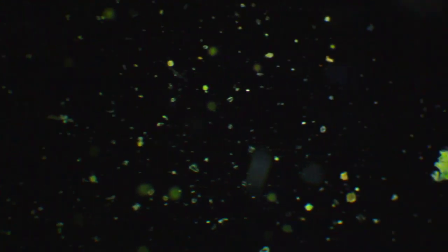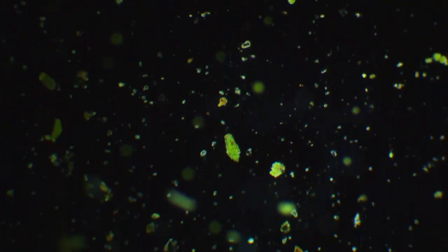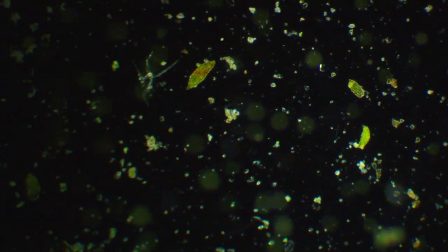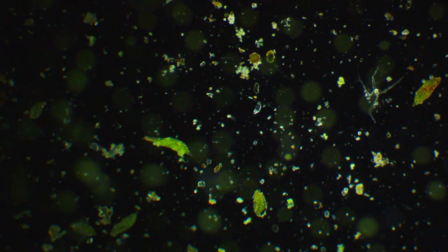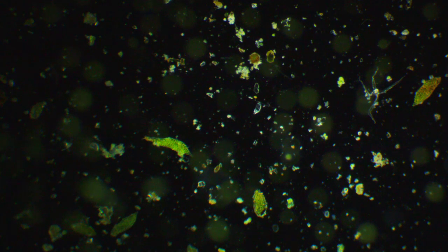Looking for tardigrades. When am I going to find a tardigrade? I didn't realize how easy it is to find rotifers, and how difficult it is to find tardigrades. Well, here anyway. I think it's because I haven't really found any lichens yet. And I think tardigrades like lichens.